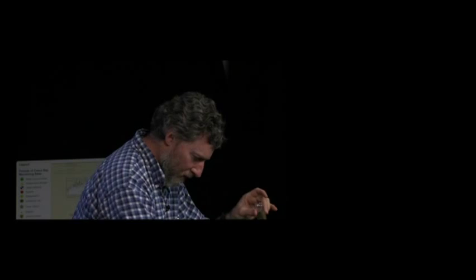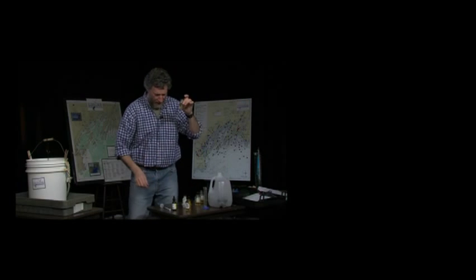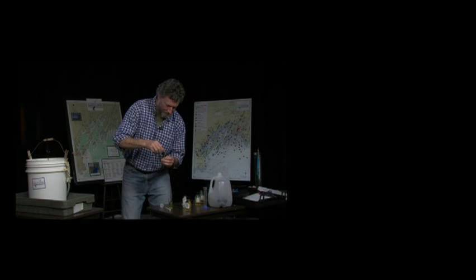At this stage, I'm feeling comfortable that this is sort of a pale straw color, again, compared to what I started with. It has a little bit more of a pale look to it. So I'm going to add some starch indicator.